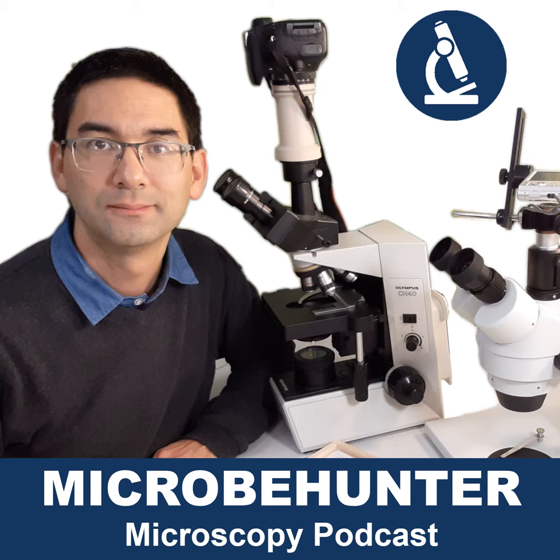But some people use the iris diaphragm to control light. Now, it's not completely wrong all the time to use it to control light, especially when you're at very high power and when the specimen is very dark. You might want to open the condenser simply to make a dark specimen visible at all, but that's not what the condenser diaphragm should be used for. Always make sure that you go to the maximum light level at a high magnification if it's too dark. Maybe I shouldn't have said maximum, but appropriate one rather, using the light intensity control, and only when you're at the maximum, and when this is not enough, then you should adjust the condenser appropriately.